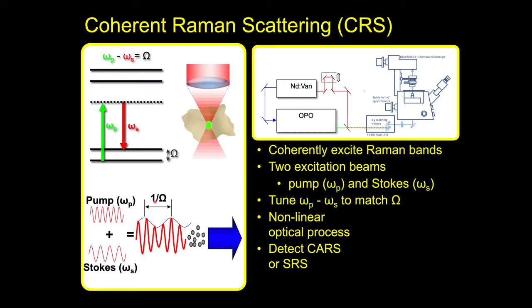So this is where the technique that I'm interested in comes in, coherent Raman scattering. In coherent Raman scattering, instead of shining a single incident frequency on the sample, we shine two excitation beams onto the sample, one called the pump and one called the Stokes.